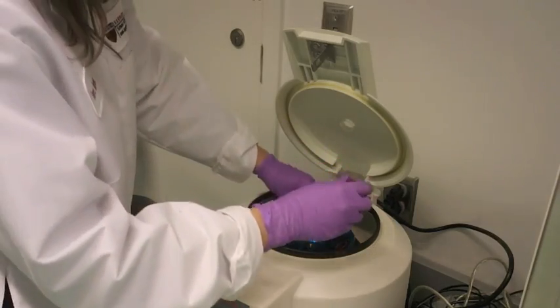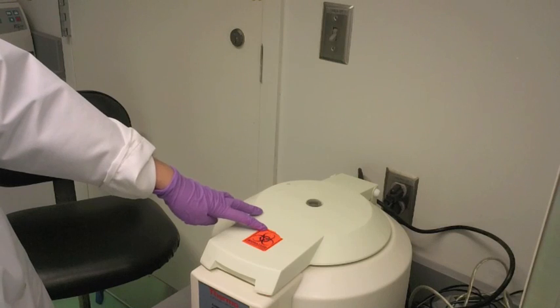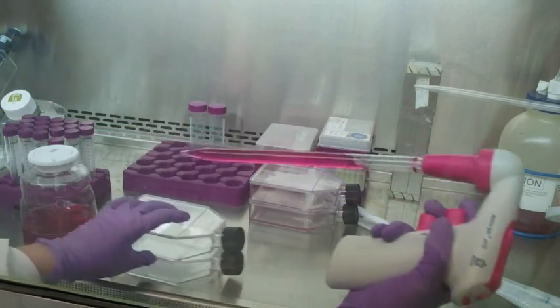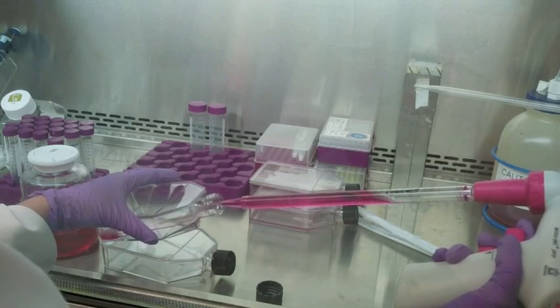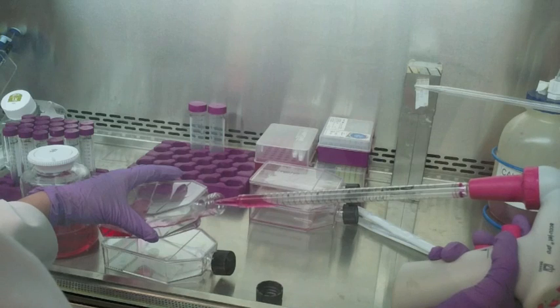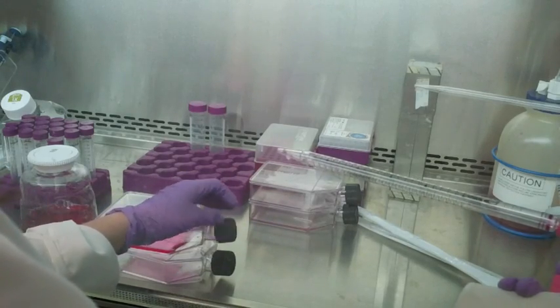During my explorations of this project, I came to realize that researcher time wasn't the only cost to the current system. In addition to spending several hours per week keeping a cell line alive, researchers only have access to the cells a fraction of the time because immediately after passaging them, the cells are at too low density to be used for any experiments. Thus, convenience and ease of access became equally important criteria in designing a solution to this problem. With these criteria in mind, I developed several concepts to solve this problem.